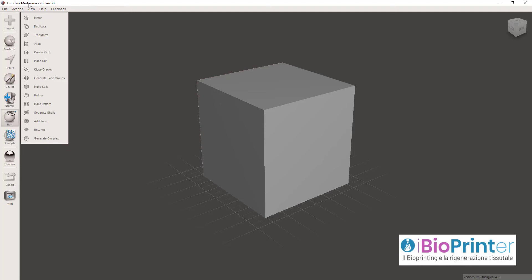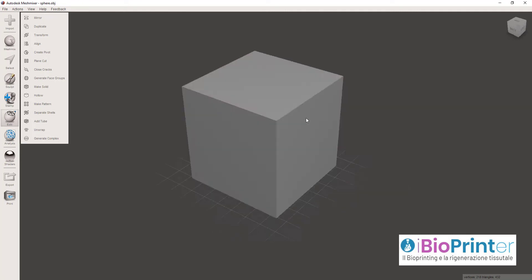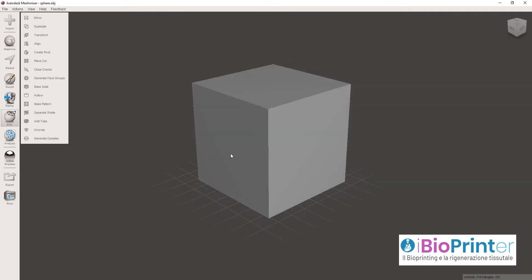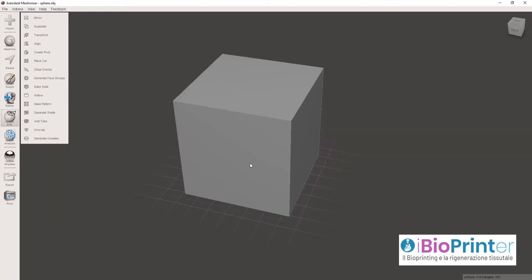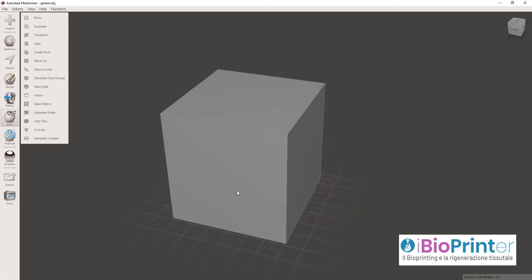È un software gratuito che tutti possono scaricare attraverso il quale si possono creare delle strutture scaffold per il bioprinting. Gli scaffold sono strutture che servono come impalcatura per la crescita cellulare e quindi per la stampa 3D di costrutti biologici.